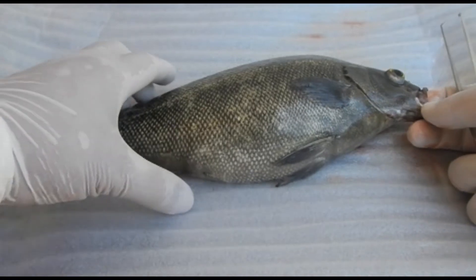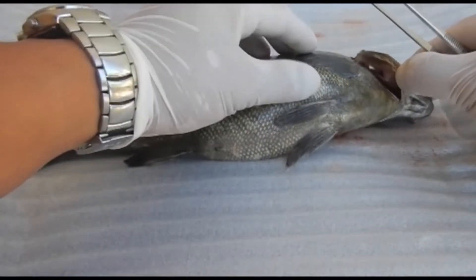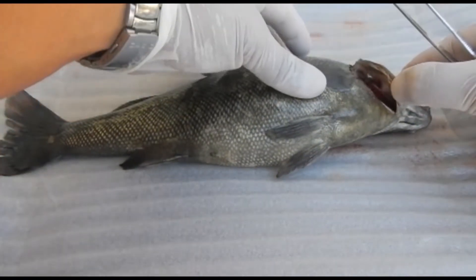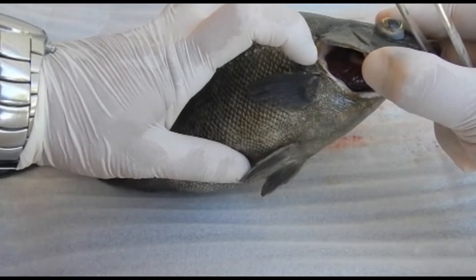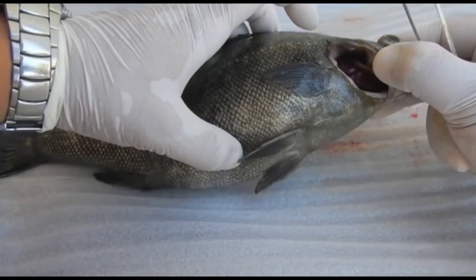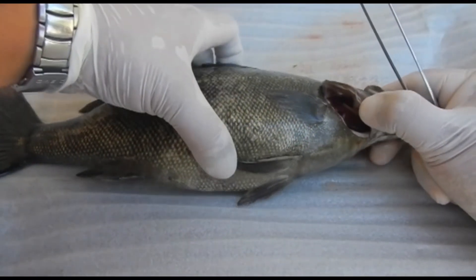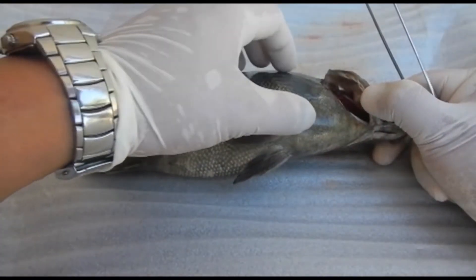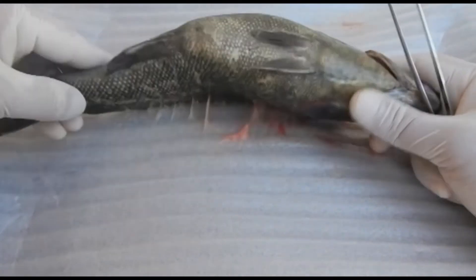Here the eyes are slightly exophthalmic due to the method of euthanasia, which was percussive stunning. Next, check the health of the gills — they should have a healthy tomato-sauce-red look. If there's pallor, that means the fish is anemic; if they're dark, that could indicate something like nitrite toxicosis. You also want to make sure the gills are not clumped or have excess mucus.